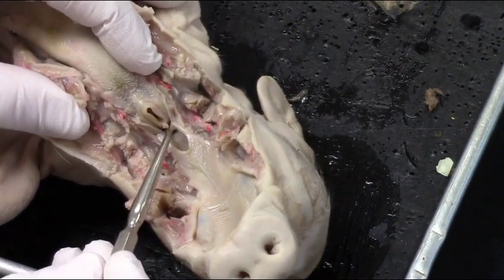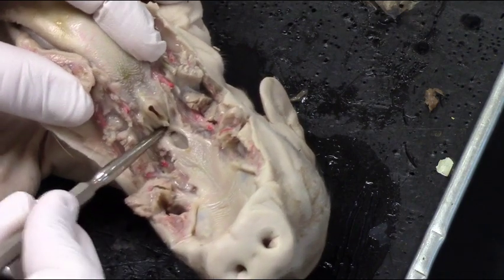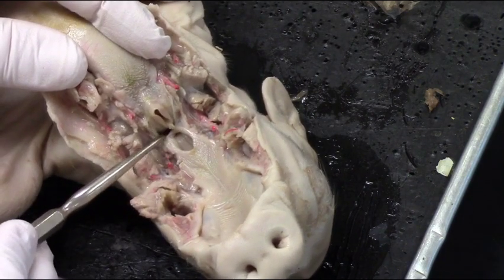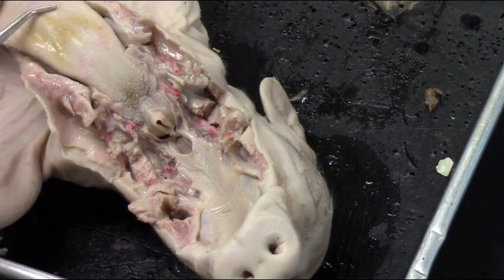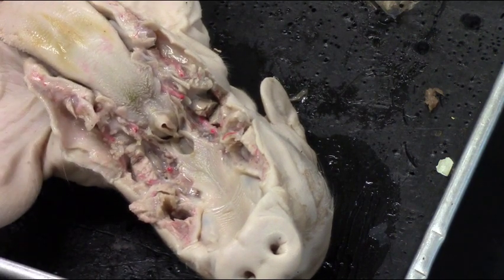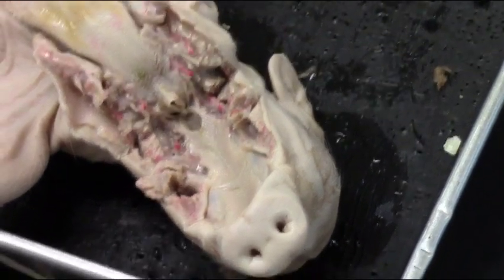So when the pig breathes in, the air goes through the nasopharynx into the glottis. That's the esophagus right there that my probe is in. The esophagus is where food goes after it passes over the tongue, over the epiglottis, and down.